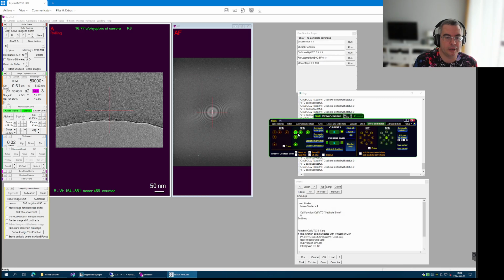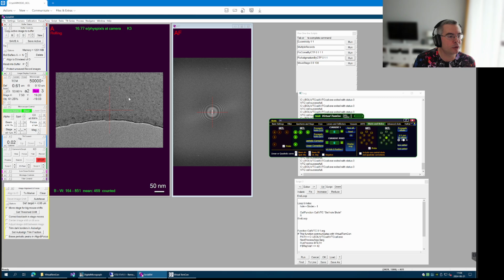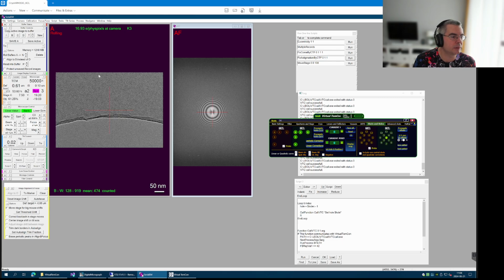Goody. Okay, so then the next challenge will be to integrate this into your JAFIS scripting, but the logic is exactly the same, so it should be really, really easy. Right, let me show you how to set up positions within a hole. So let's be serious about it. Let's say that our record is here. So let's say my record needs to be somewhere here.